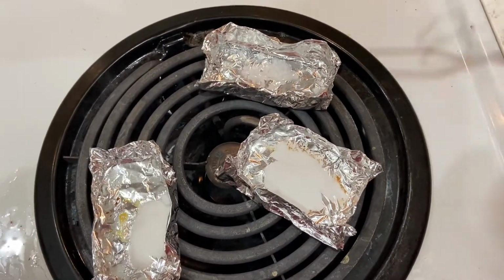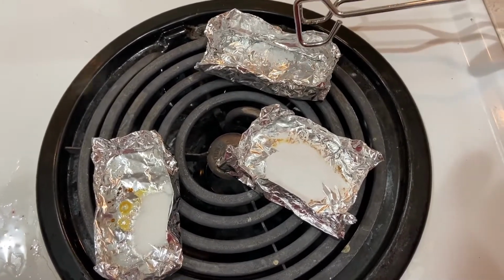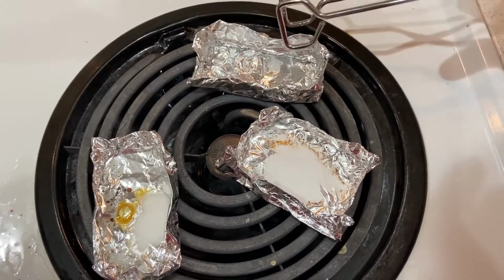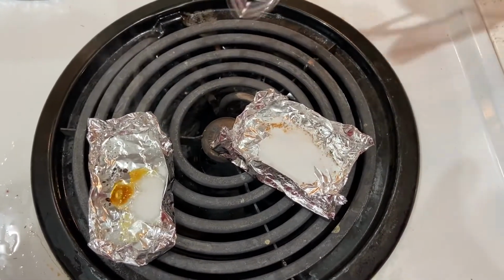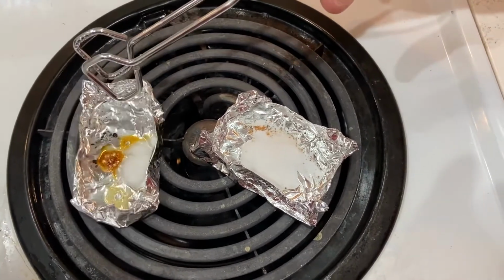So you see B and C are both starting to change. C, I believe, started first, and you can see it's almost totally melting down into a clear liquid like that. B is also really taking off over here. I mean, not B, but substance A is really taking off over here now.